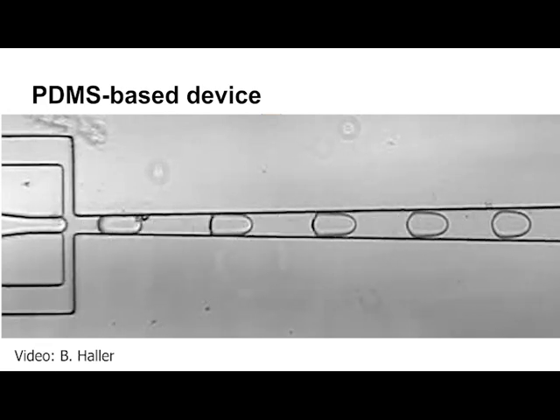Note that this microscope video is slowed down. In fact, thousands of compartments can be produced per second.